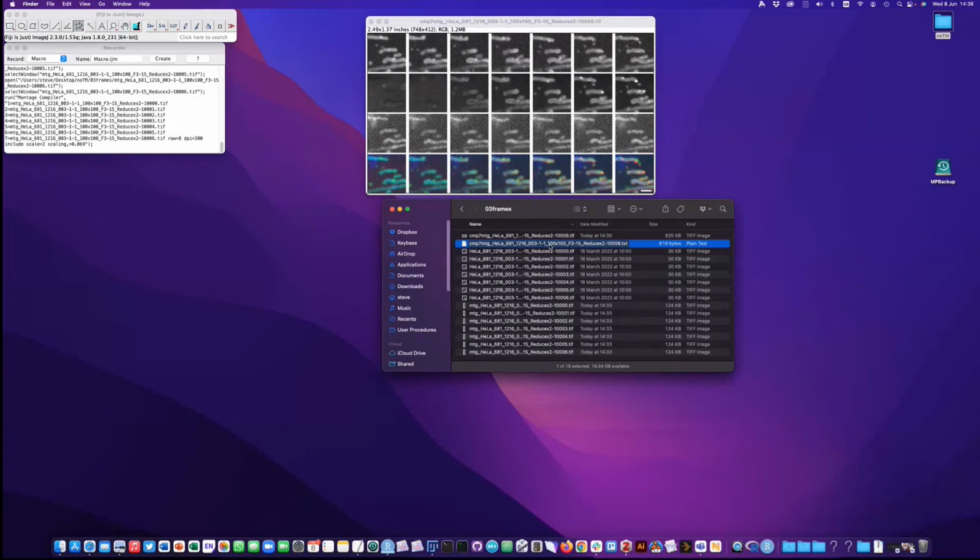There's no limit to the number of times you can run the compile montage, so you can make really big montages if you want by sticking lots of montages together. It can get pretty wild. But anyway, I've just shown you a basic example there of what the code can do and how it can simplify and make figure making more reproducible.